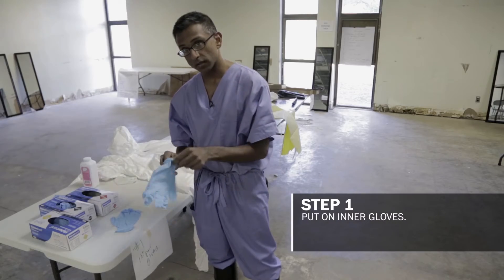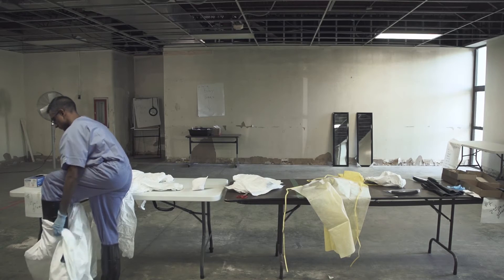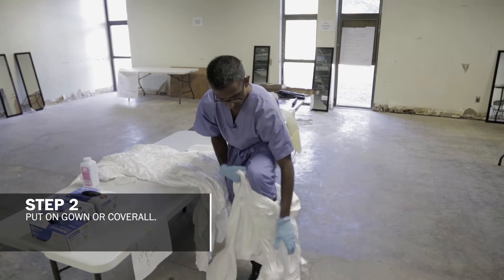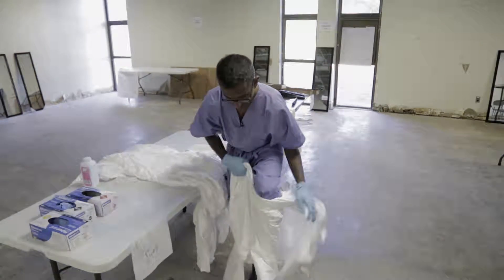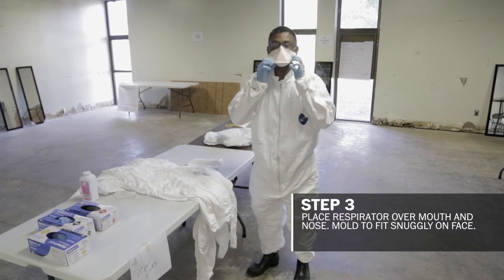The first step is the first pair of gloves. Following that, we place an impermeable coverall. The next step is a respirator, and we mold it to our face.